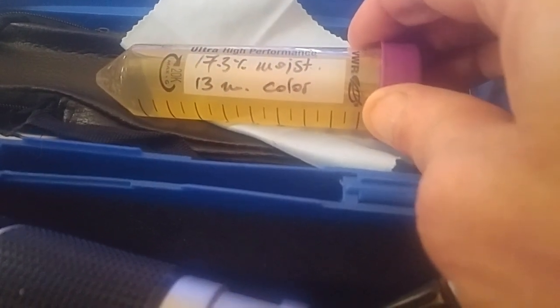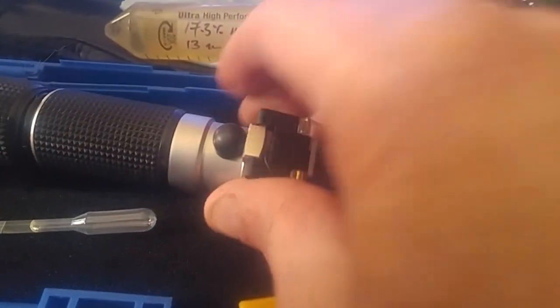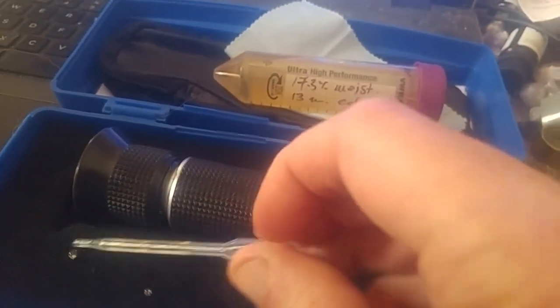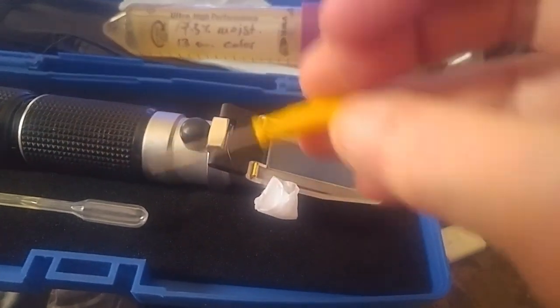I'm not sure what the 13 color means, but back to here. This comes with a little thing for scooping up the honey that I've used already. I sent the calibration off whack because I didn't know what I was doing when I first got it, and I had to reset it.